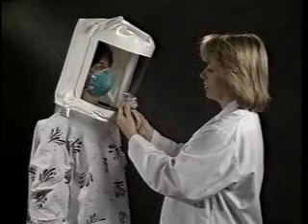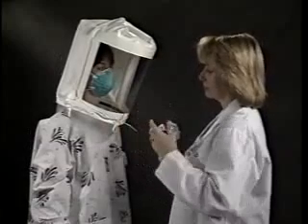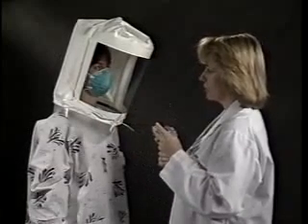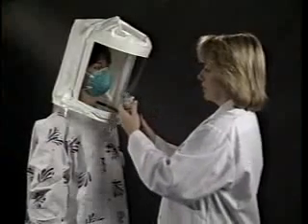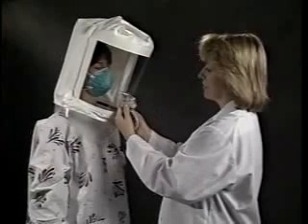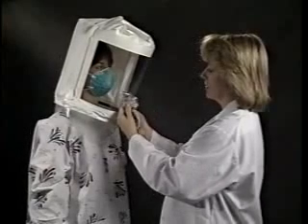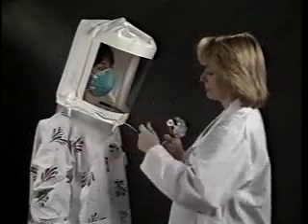To maintain an adequate concentration of aerosol during this test, 1/2 the number of squeezes used in the previous test is injected every 30 seconds thereafter. For instance, if you use 10 squeezes initially, you would follow up with an additional 5 squeezes every 30 seconds after the start of the test. After the initial aerosol is injected, ask the subject to conduct a series of exercises for 60 seconds each. Remember to inject 1/2 the number of original squeezes every 30 seconds through the fit test exercises.